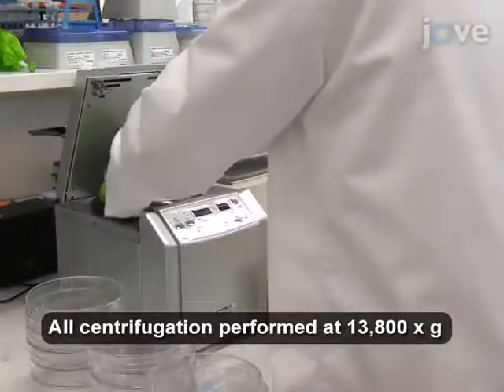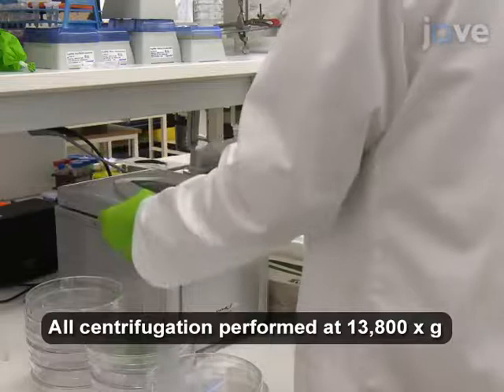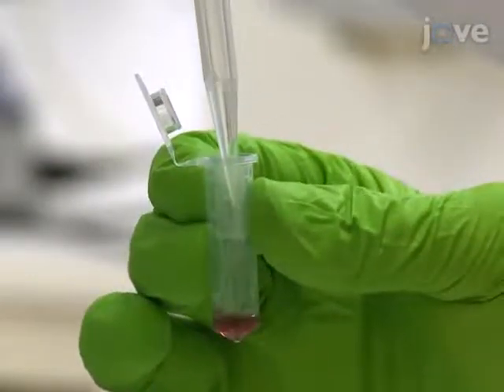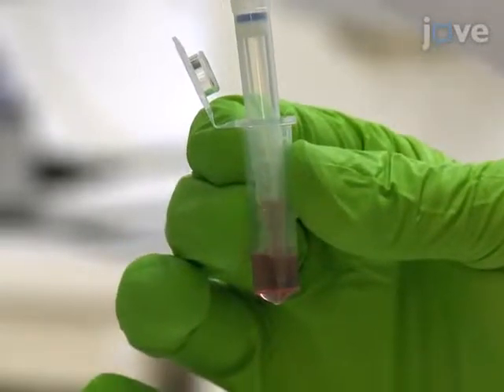Then centrifuge the mixture at 3,800 x G for 15 minutes and discard the supernatant. Re-suspend the pellet of PEG-modified gold nanoparticles in 500 microliters of deionized water by gentle pipetting.